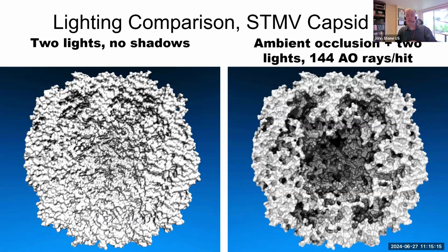we have what we call ambient occlusion lighting. If you've ever talked to somebody who's a photographer, you will have probably heard the advice that it's better to take photos outside on an overcast day rather than when the sun is straight overhead and beaming down on you. The reason for that is when you have an overcast day and you have clouds, it diffuses the light in all directions. And so you get sort of an omnidirectional lighting pattern. The result is you get very fine gradations in shadowing, and those fine gradations in shadowing allow you to see surface details.